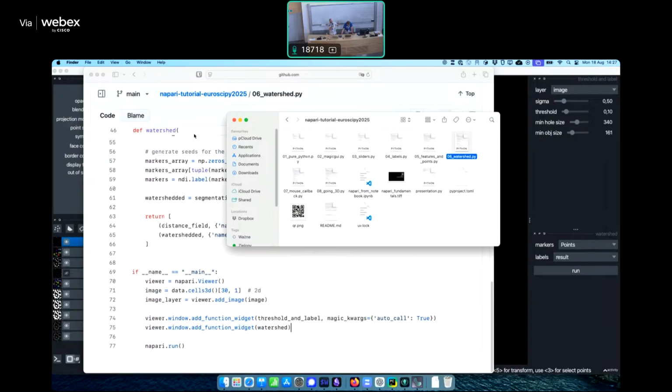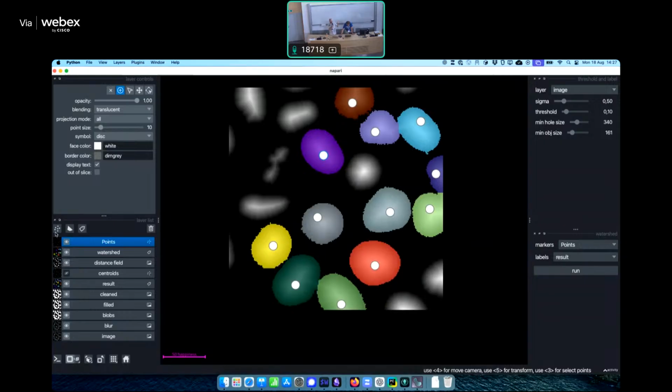The points layer, by creating a new points layer. On the left, there's that button. Sorry, I'm pointing there, but it's here. This small button with these dots is creating an empty points layer. Yeah, but then how do you make the actual point? You select this. We're so used to doing this that we don't realize that we have to explain it.